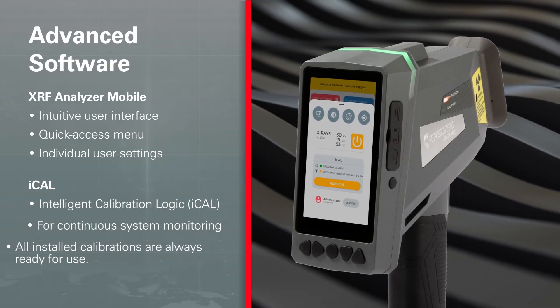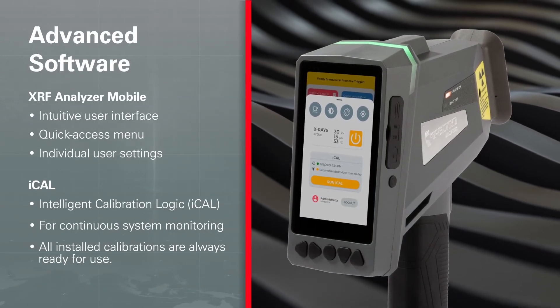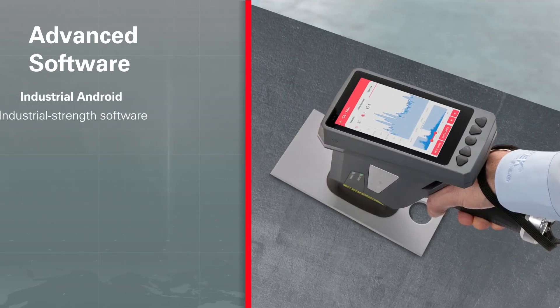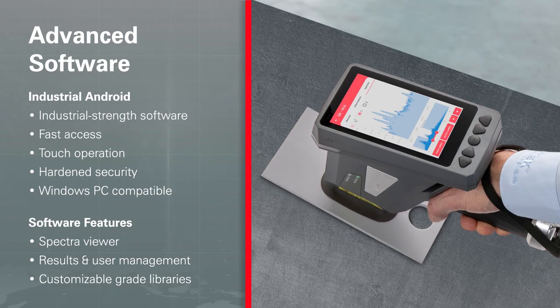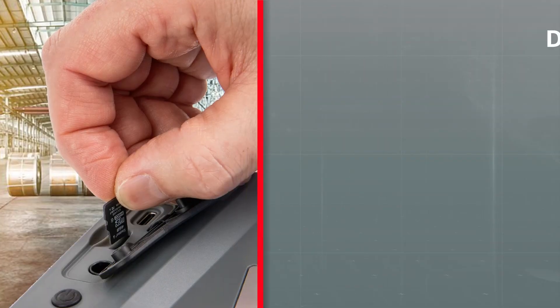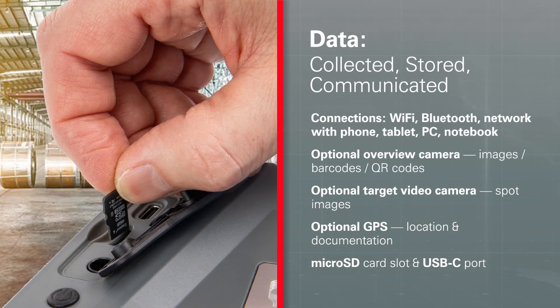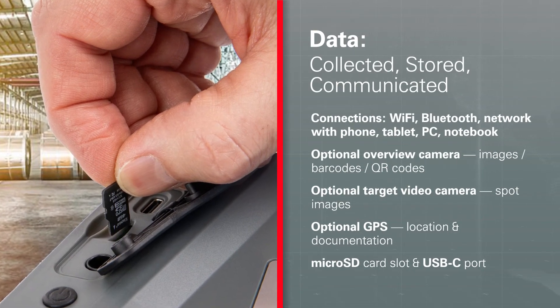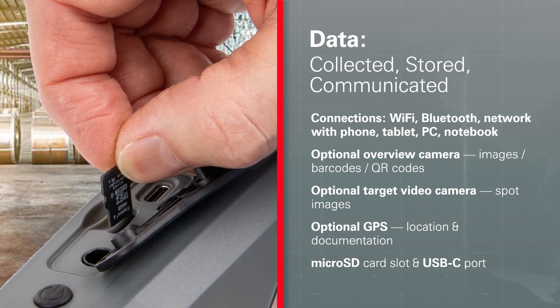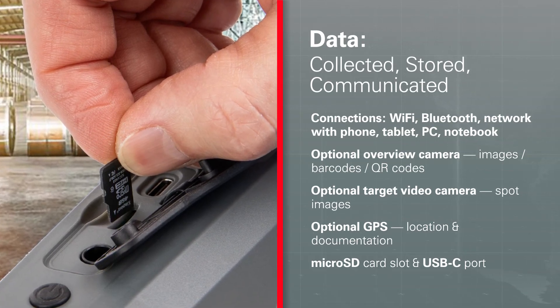This handheld runs on powerful Spectro XRF Analyzer mobile software with Spectro iCal Calibration, combined with fast reaction-compatible industrial Android software, including some innovative features. The instrument captures data and documents it everywhere it goes. Features and options include onboard GPS, two cameras, Wi-Fi, Bluetooth, and USB.